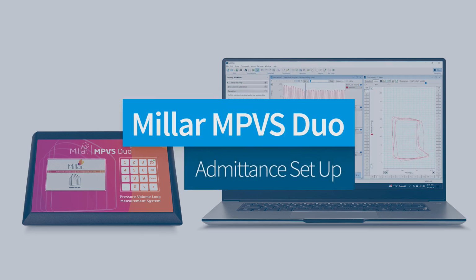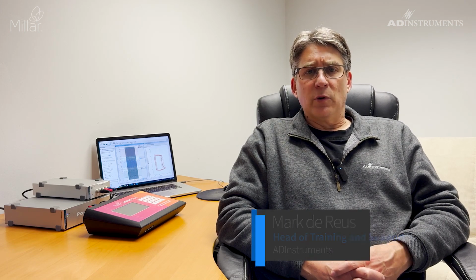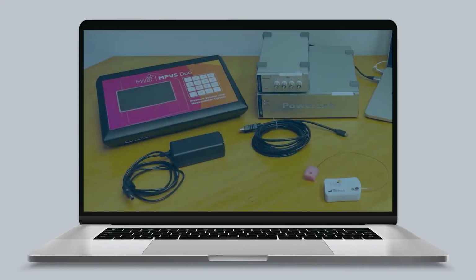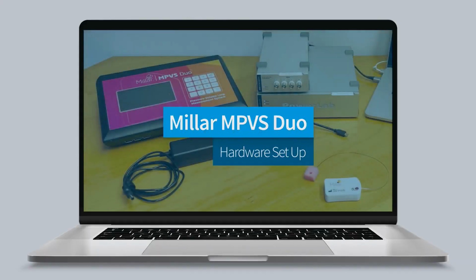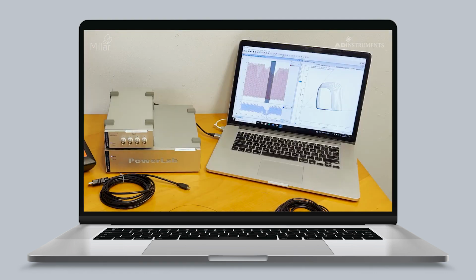Hi, I'm Mark, and I'll be demonstrating how to set up the MPVS Duo and LabChart for PV recordings in small and large animals using the admittance method. Connect all the hardware as per the video entitled MPVS Duo Hardware Setup for the admittance method. Make sure you have installed LabChart and the PV Loop 2.6 module.